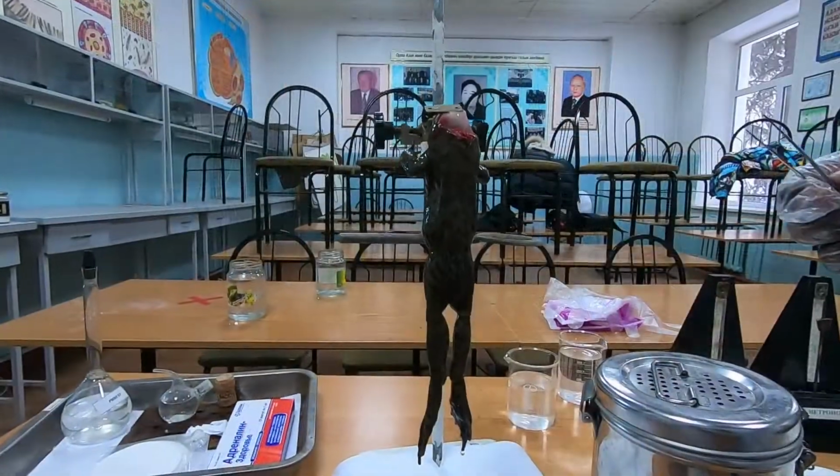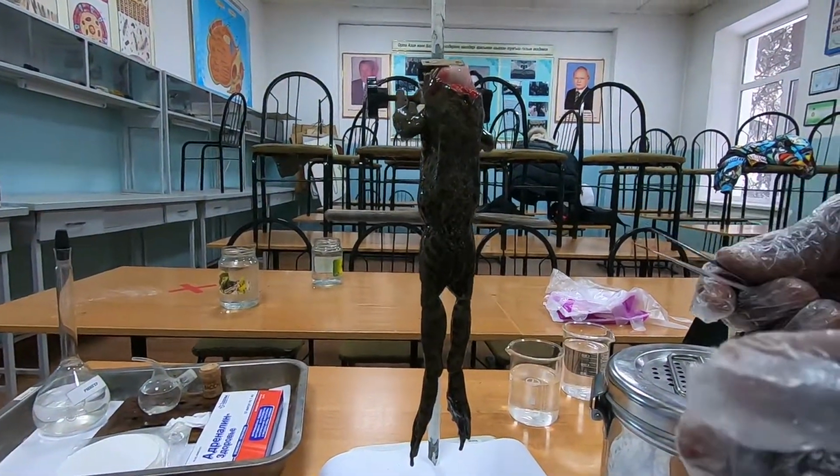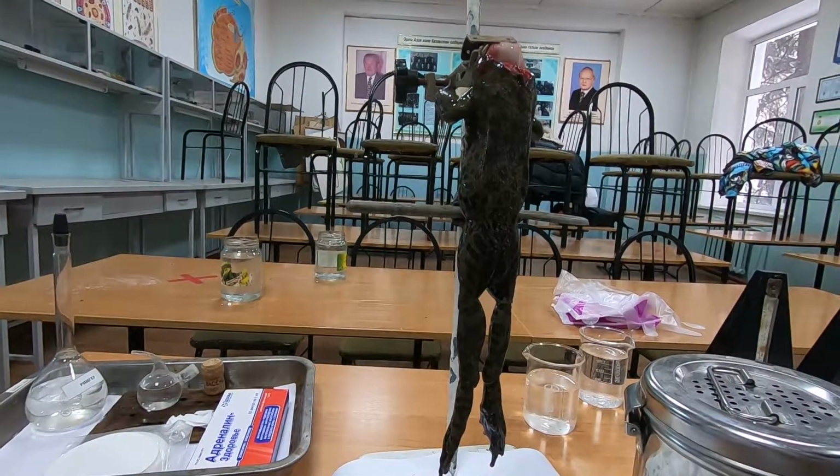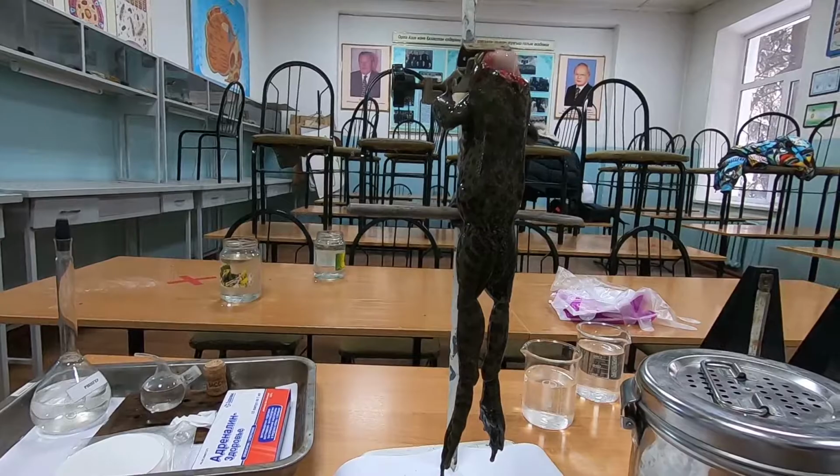So, dear students, after a minute or two, we're going to apply a different concentration of sulfuric acid.